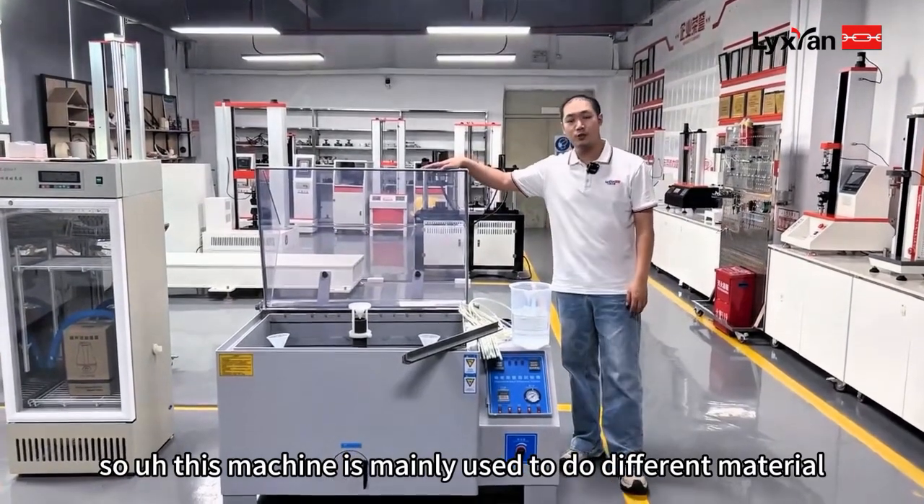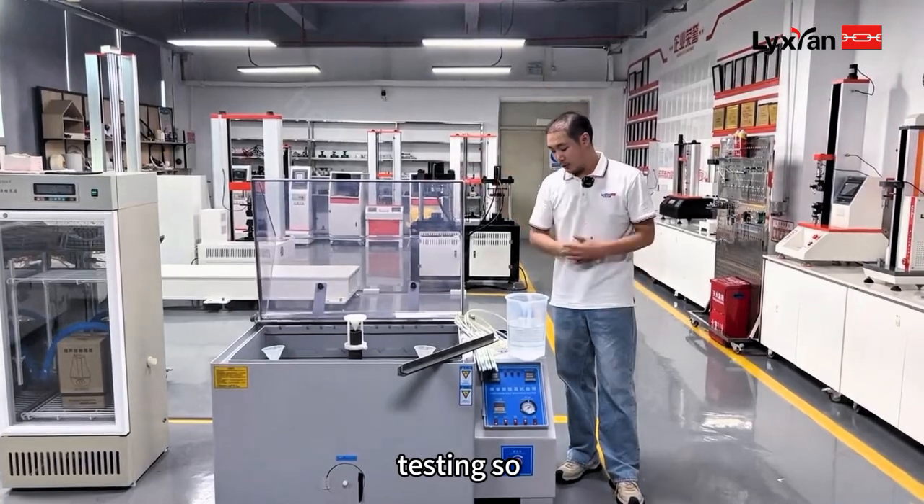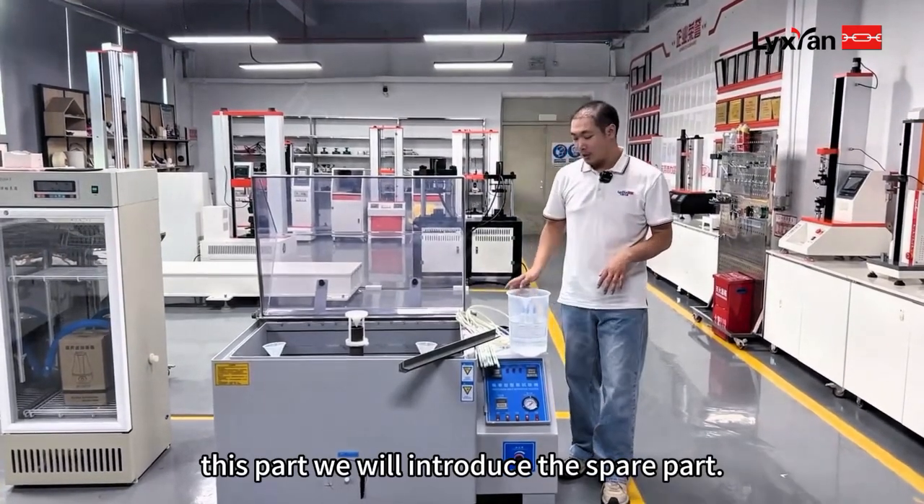This machine is mainly used to do different material corrosion testing. In this part, we will introduce the spray part.